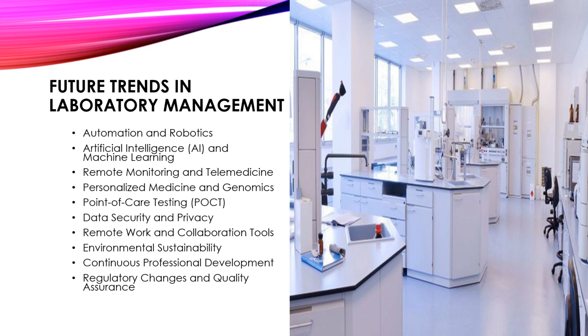Personalized medicine and genomics. As personalized medicine becomes more prevalent, laboratories will need to accommodate the growing demand for genomic testing and analysis. This includes integrating genomic data into diagnostics and treatment plans.